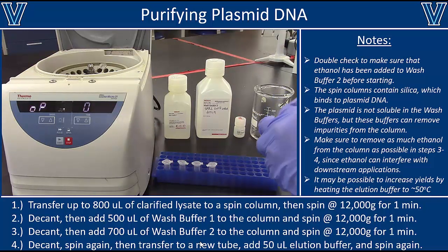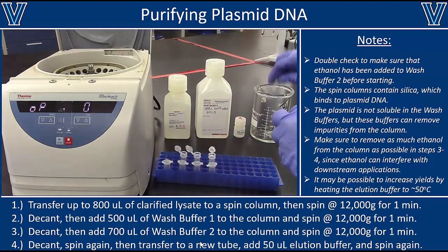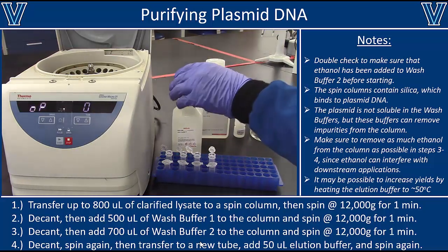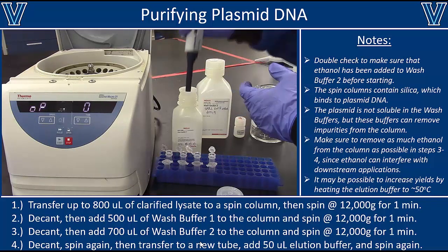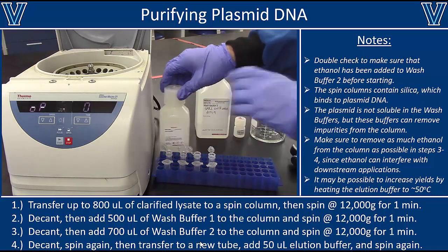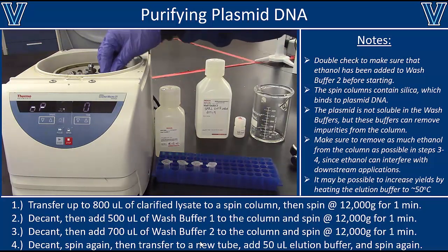All right, so here we go. We've done the second spin now, and we're going to decant the rest of that liquid for all of our samples. At this point, our plasmid DNA should be tightly bound to that resin, but there are also some impurities. So we have to add our first wash solution now. We're going to add 500 microliters of wash solution 1. Very importantly, this is a buffer that will not dissolve the plasmid DNA. The plasmid DNA will stay on the resin, but impurities that are bound to the resin will fall off. They will elute from the column during this step. So I add wash solution 1 to each of my tubes, and then balance them on the centrifuge, loading them opposite one another, and I spin at 12,000 G for another minute.